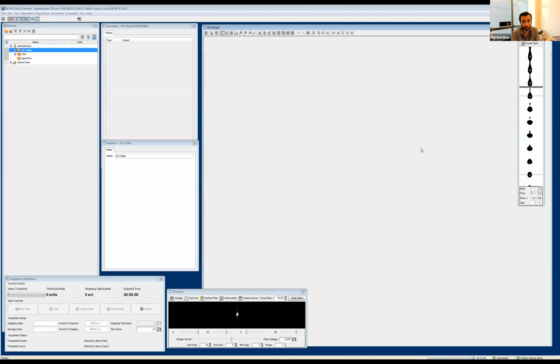Right. I don't know if they were talking about the amplitude. The amplitude, you can't set to 0, right? It goes down to 1, I believe. That's the lowest amplitude we can apply. You always have to apply an amplitude. I don't know if that was the question, but in other instruments, you can adjust the phase, right?